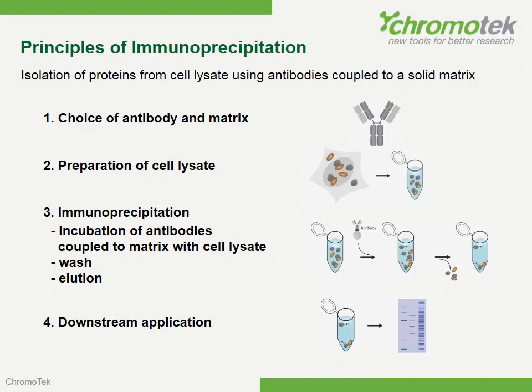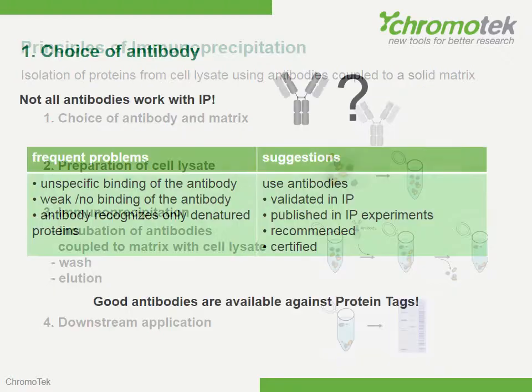So the principle of an immunoprecipitation reaction is very simple and straightforward. However, all of you who already did an IP know that there can be many pitfalls during such an IP. So now let's start to have a closer look at the single steps of an IP.